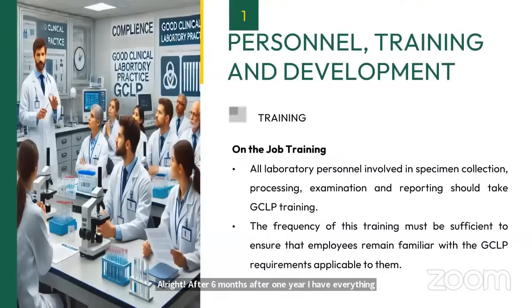No, the frequency should be sufficient to ensure that your staff remain familiar. They should be aware every time of what the GCLP requirements are. It is not that I have done the training, got the certificate, and forgotten everything. They should be aware and familiarized with all the requirements of GCLP.